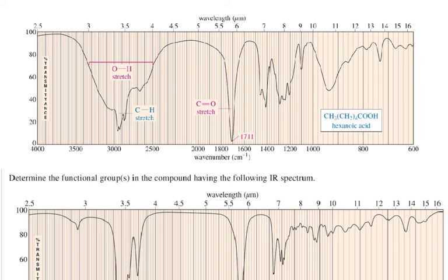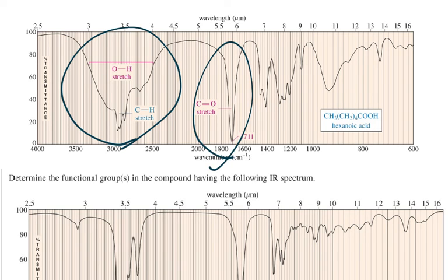And so here's another spectrum. This one is a carboxylic acid. So with a carboxylic acid, because the OH stretches around 3000, it's going to eclipse all the regular signals you see here. And it's going to look all weird and broad like that. And then you're also going to see the carbonyl signal.